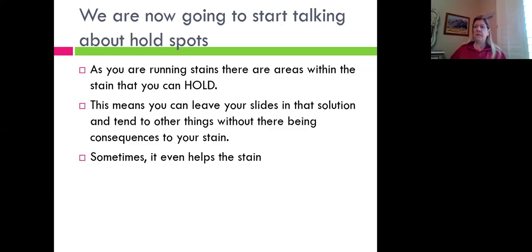I think my largest number of running stains all at the same time was 32, and that's 32 different stains, not necessarily just 32 slides. As time progresses and you're in special staining, you'll get to know how to start to manipulate those.